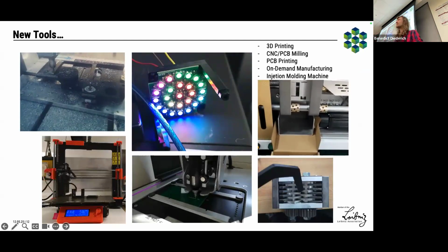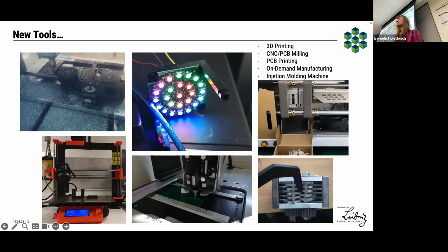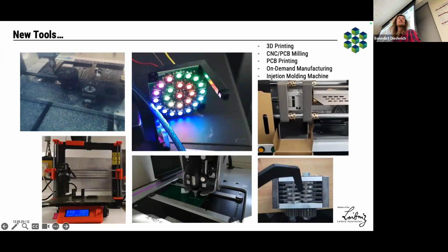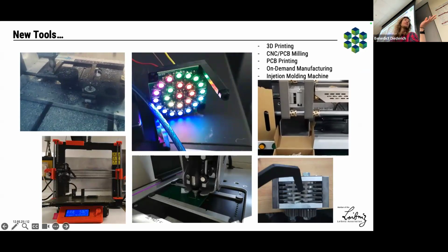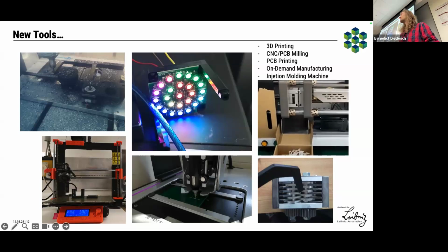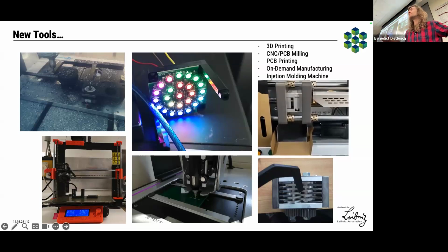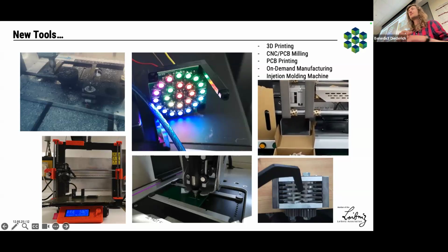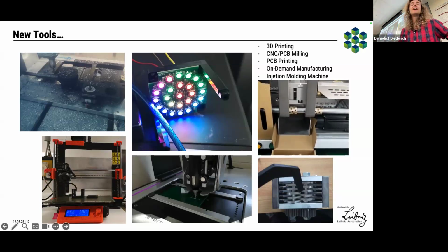Then one of the big patents was lifted, and people started building their own little RepRap machines. Now I think everybody has printers. Only in this room, I see maybe five of them. Some are proprietary, but most of them nowadays are based on open source technology, and this is really pushing this field forward quite a lot, and also optics.